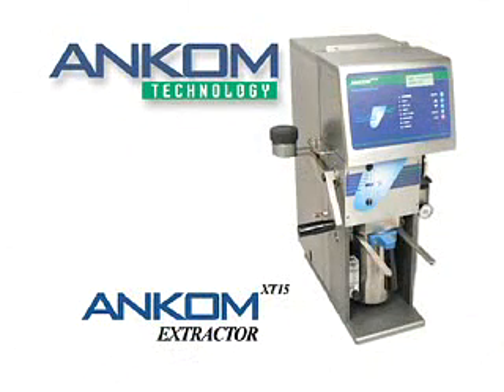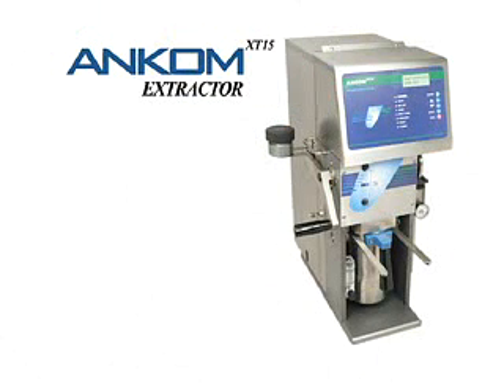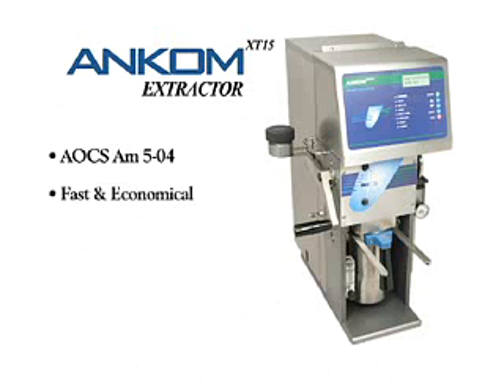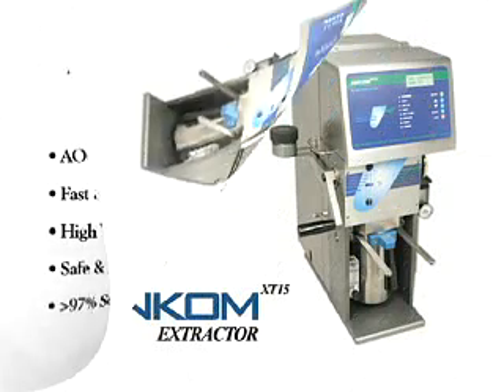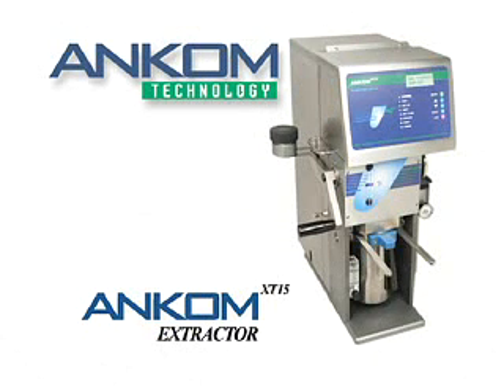We hope you have benefited from this brief operational overview and welcome any questions you may have. To summarize, the ANCOM XT15 extractor is officially recognized, fast and economical, capable of high volume, safe and automatic, and recovers and recycles solvent at a rate of 97%. The ANCOM XT15 extractor provides you with a low cost, high volume alternative for fat and oil extractions and will make your lab more efficient and economical.